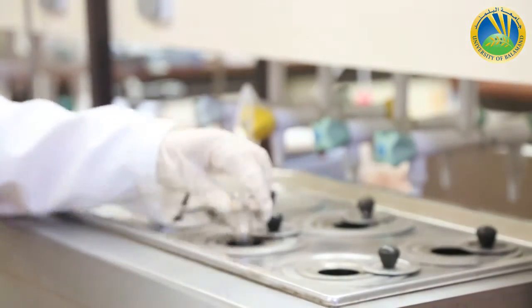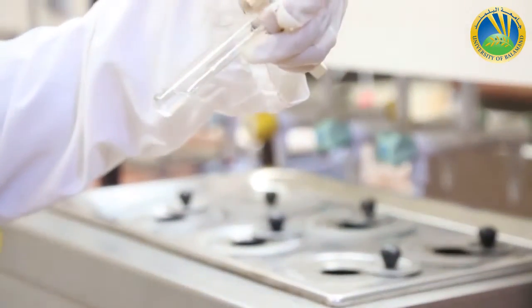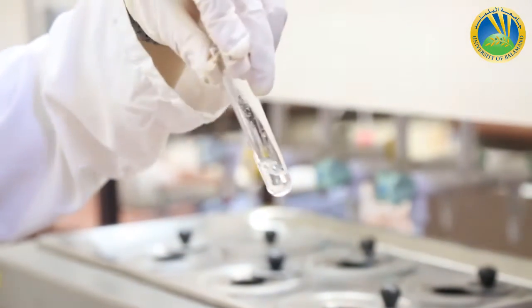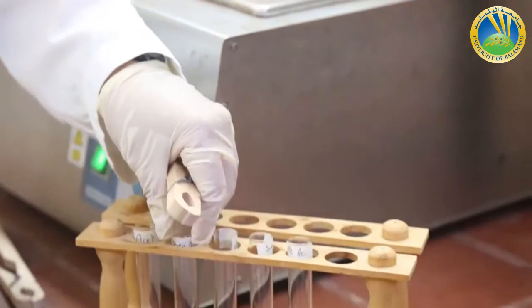Now I can check the benzoic acid. I can still see the granules of benzoic acid at the bottom of the tube, so benzoic acid is not soluble inside petroleum ether at hot.